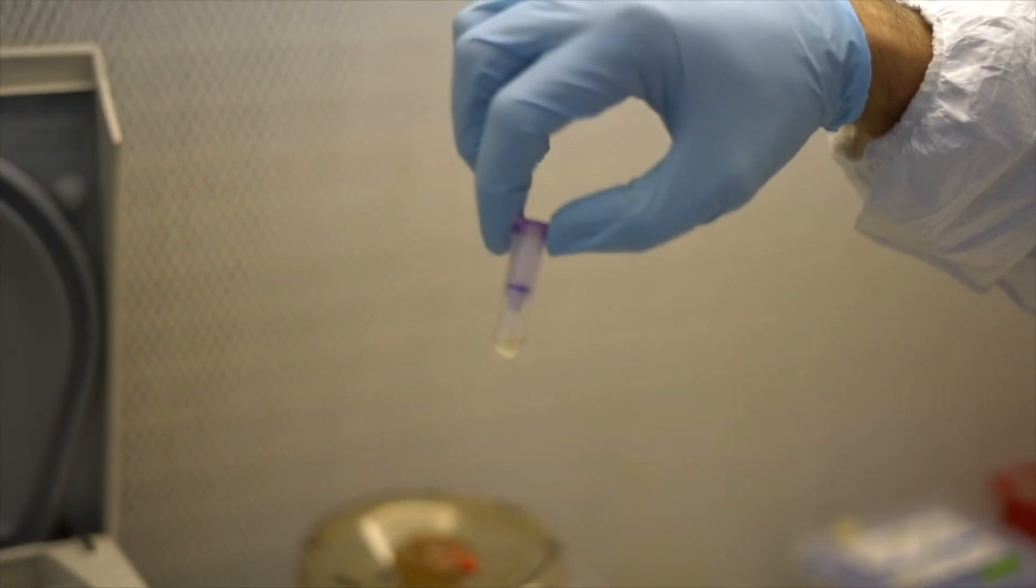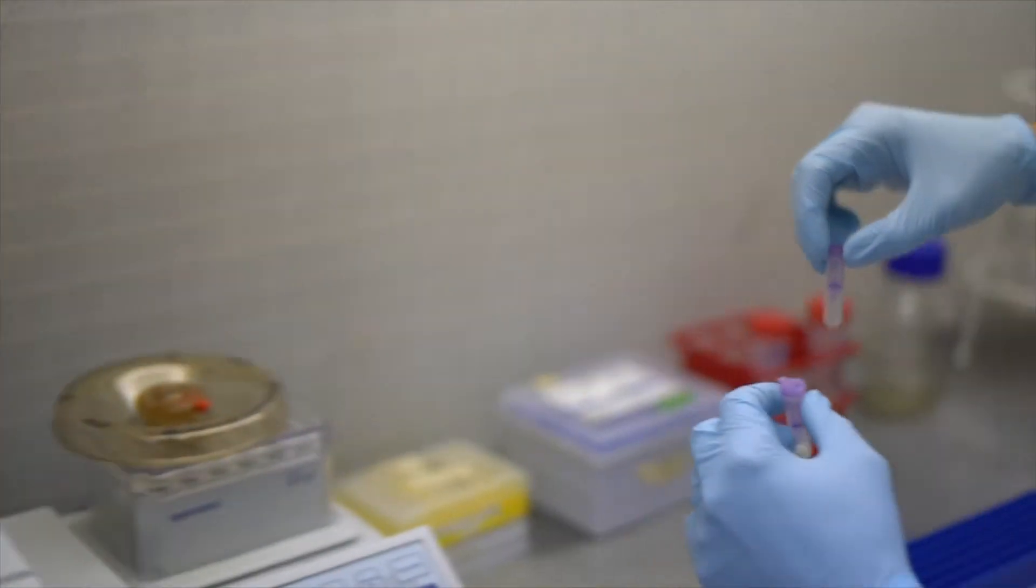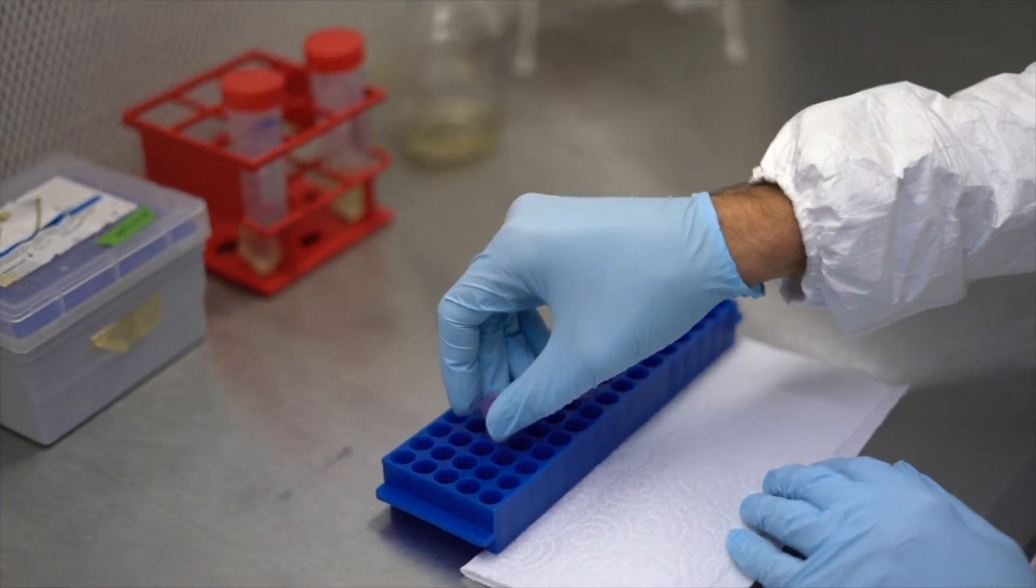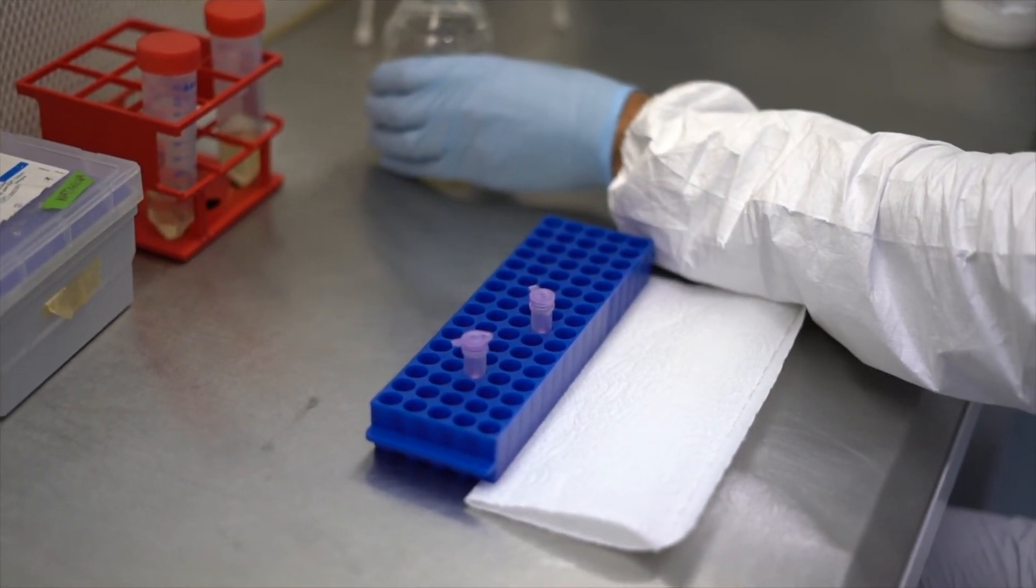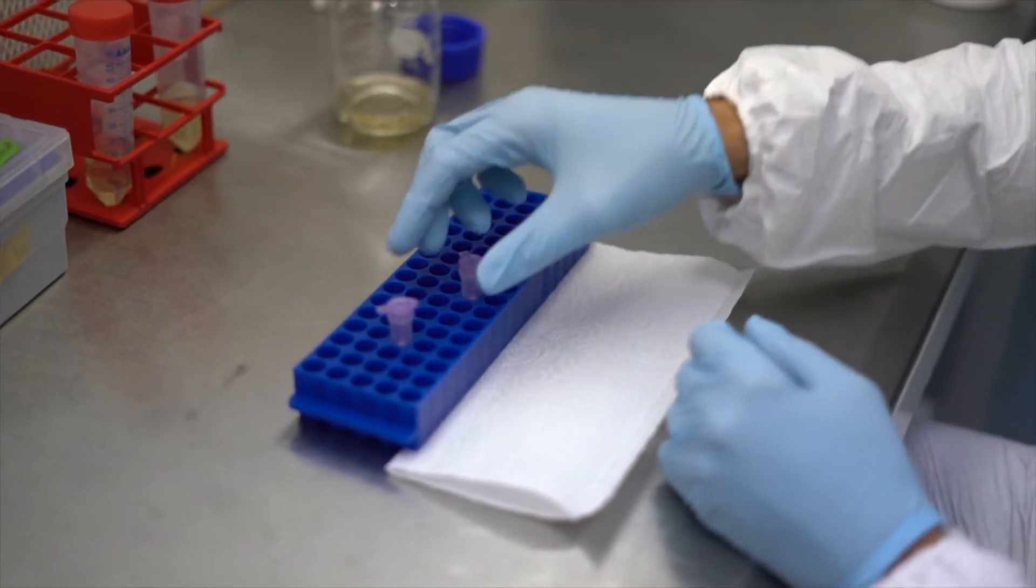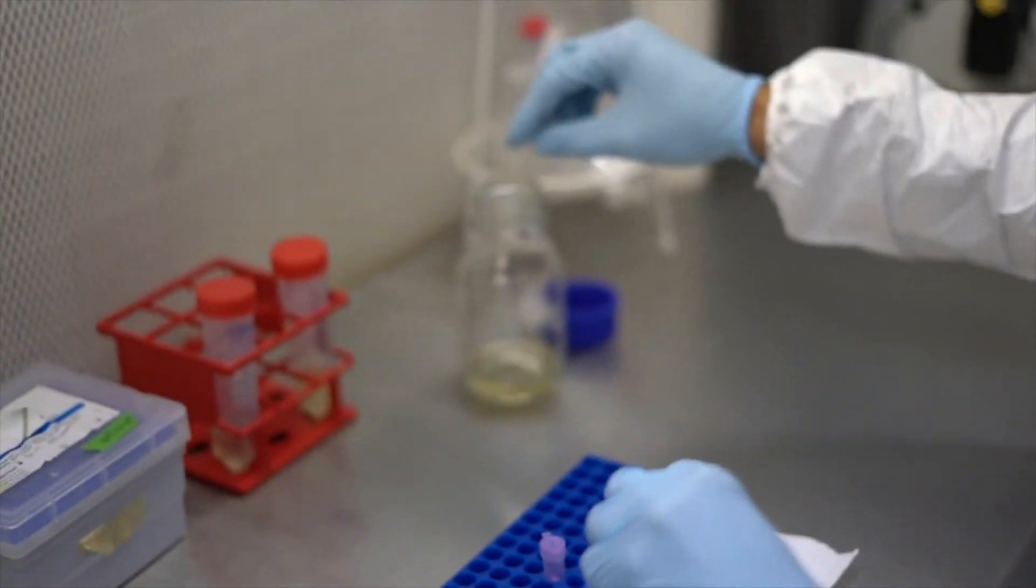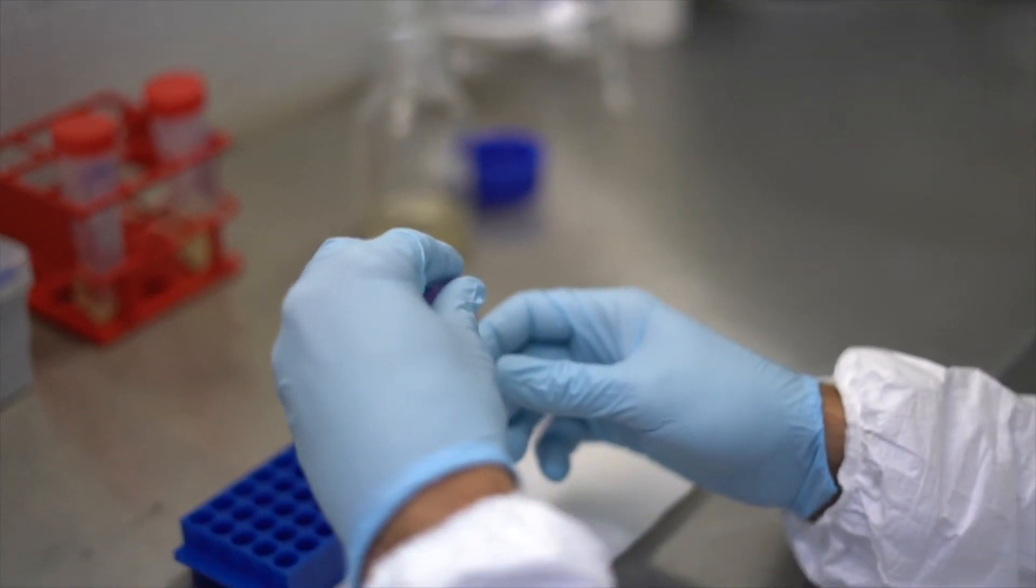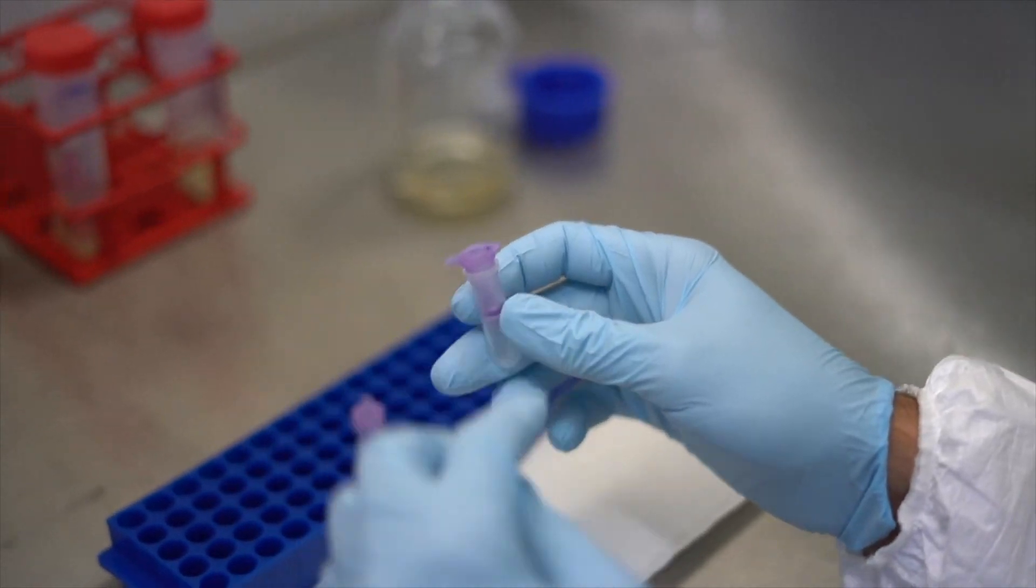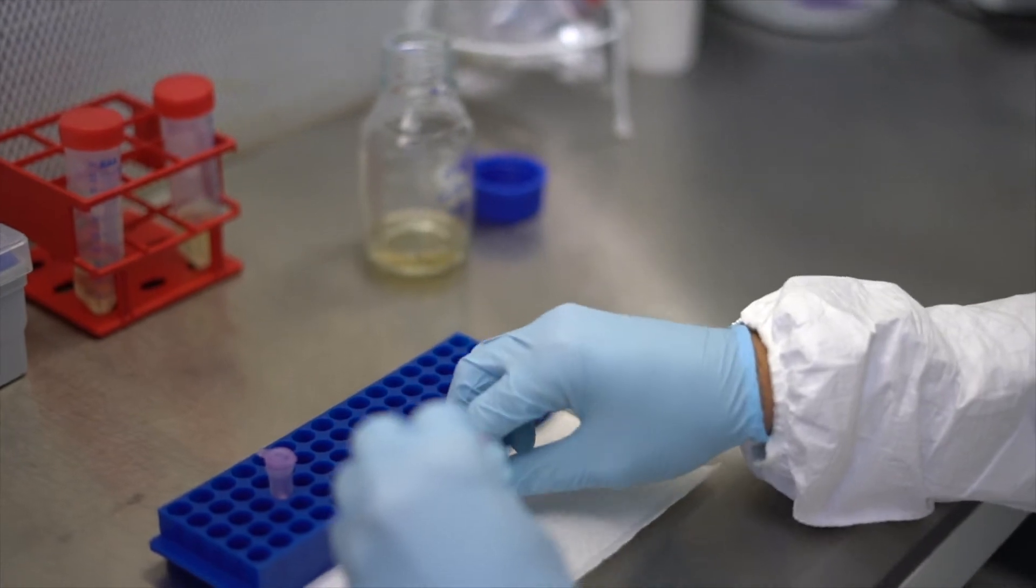Now everything has flowed through the MinElute column. We can get rid of this liquid waste. We have to collect this separately because it needs to be disposed separately. Placing the MinElute column back, being careful not to touch the collection tube.